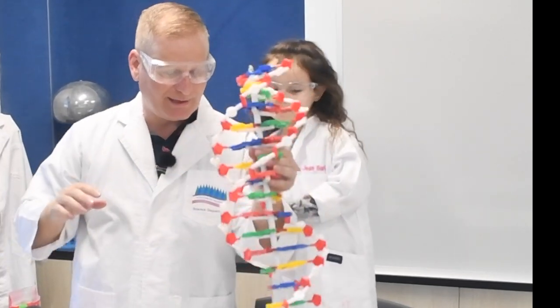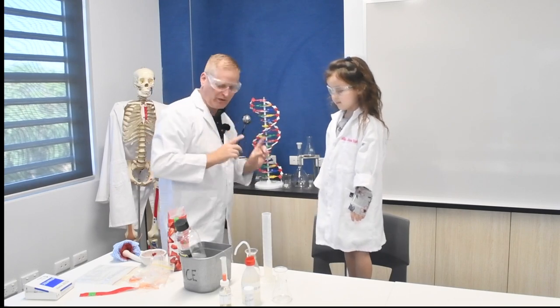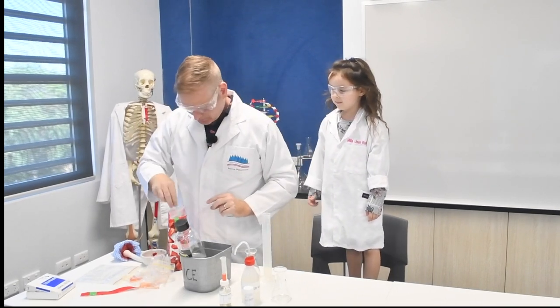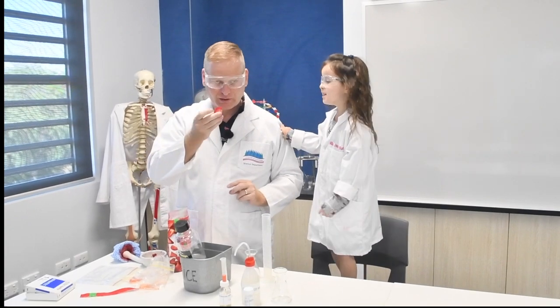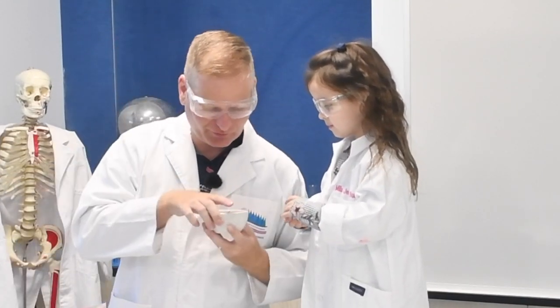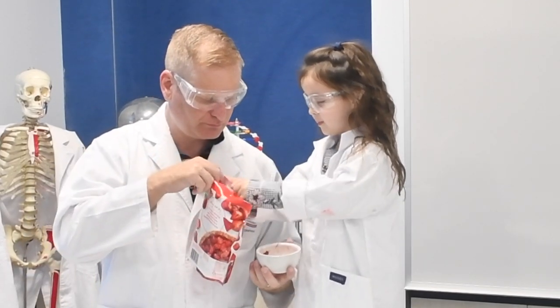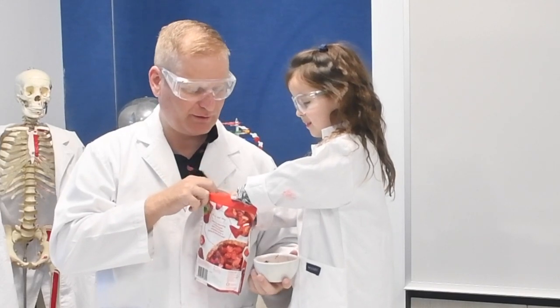Okay, so let's put this away. Let's see if we can get the DNA out of the strawberry. So the first thing we need to do is we need to get some strawberries. Can I do this one? Mm-hmm. And we need to break them down so we can get into the cells. So put the strawberries in there. Yeah, get me some more. I'll tell you when to stop.